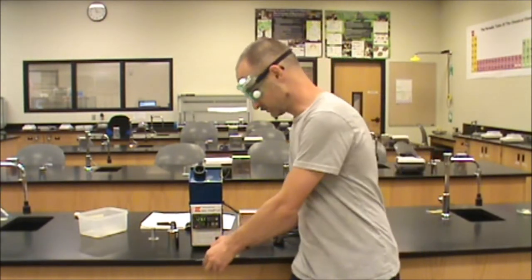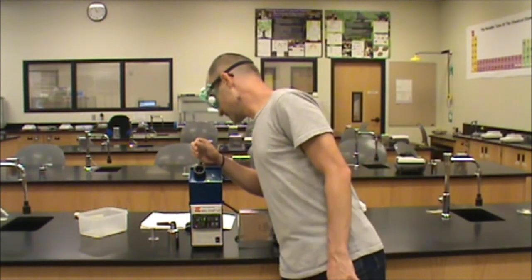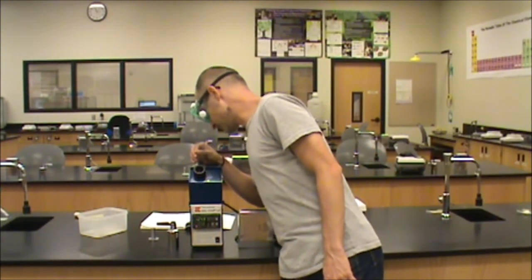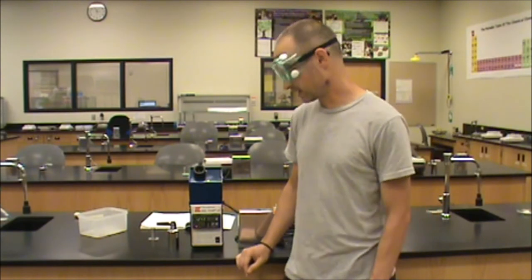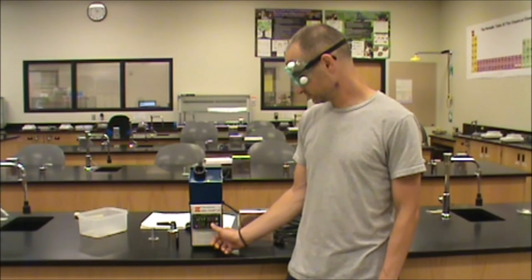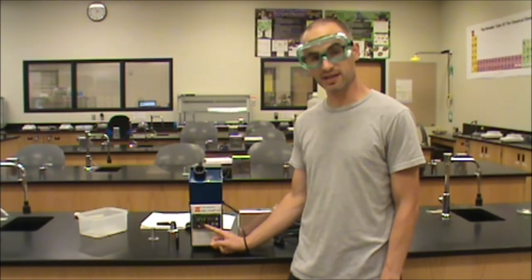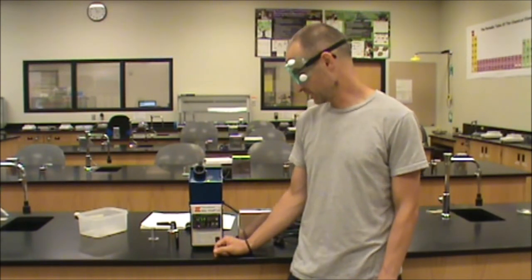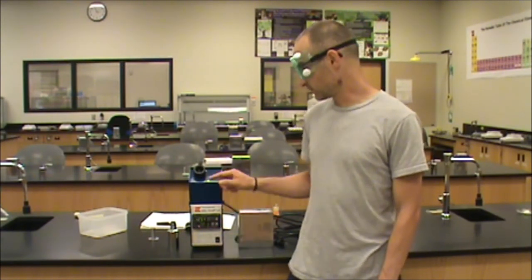We're going to take our melting point tube and load it into the top of the instrument. If you look at the top, you'll see three slots in which you can insert the sample — it doesn't matter which one, any of the three is fine. In order to start the run, we hit the ramp/cool button. We see that the lower numbers change to a five, indicating that we're ramping now at five degrees per minute. We should see the upper temperature begin to change, and at this point we want to make sure that we look into the objective and watch for the melting process.